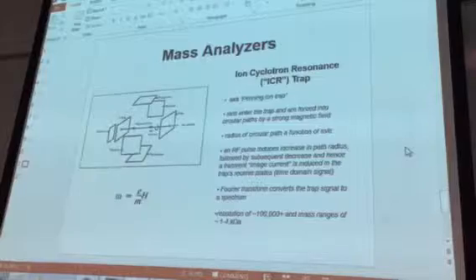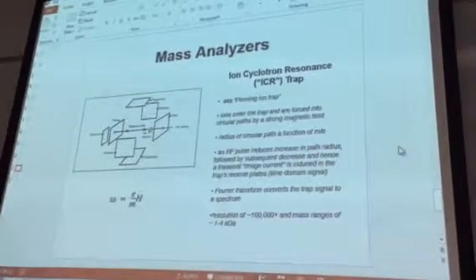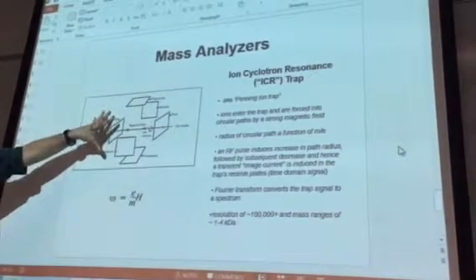And last but not least, you can use mass analyzers that will generate a time-varying signal, not like the time of flight. This is different. These are not field-free, right?